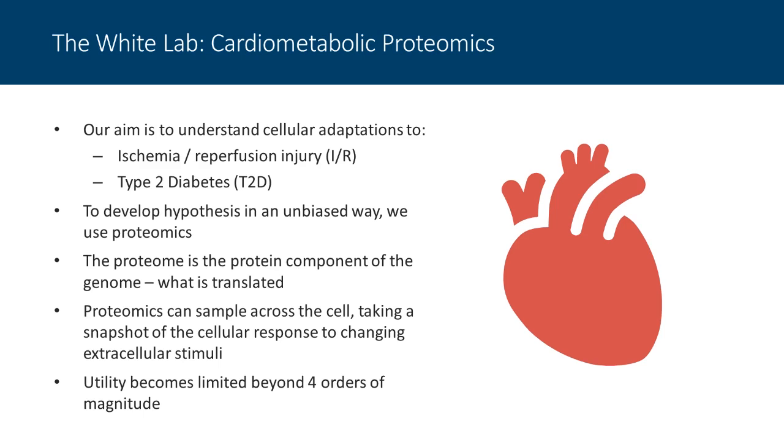So what is the proteome? The proteome is the protein component of the genome. In other words, what is translated. And this really is one of the closest points to the physiological function that we can monitor. The genome has an influence, but the proteome will have a greater influence, and the metabolome will actually have an even greater influence on the function of the heart that we are able to observe using the Langendorff perfusion system.